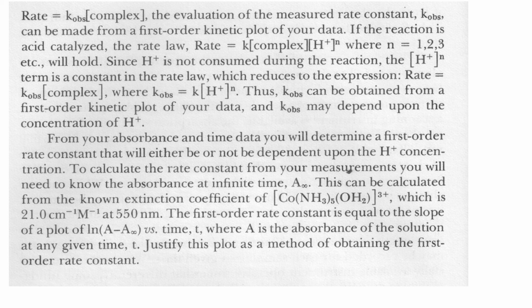You record the UV visible spectrum from 400 to 650. Now the H2O complex absorbs at 550 and its concentration starts increasing because it's the product. A infinity, you can calculate it. You don't have to wait for A infinity.